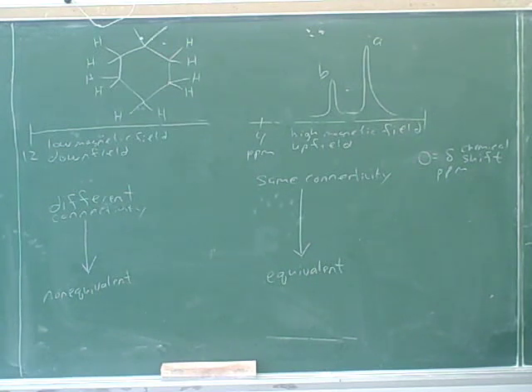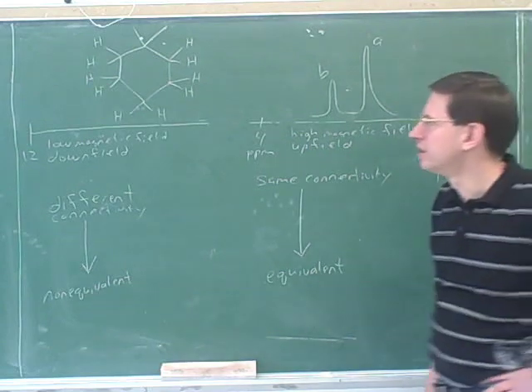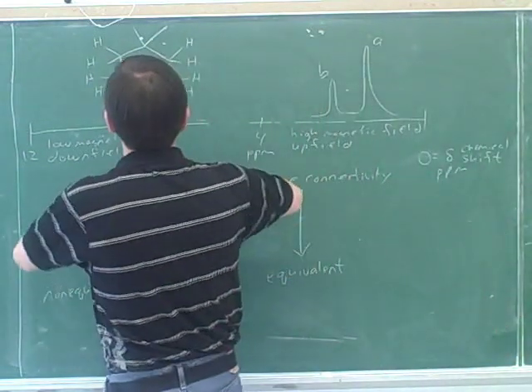So those are two methyl groups at the top. Yes. Oh, so which means I forgot they have hydrogens too.